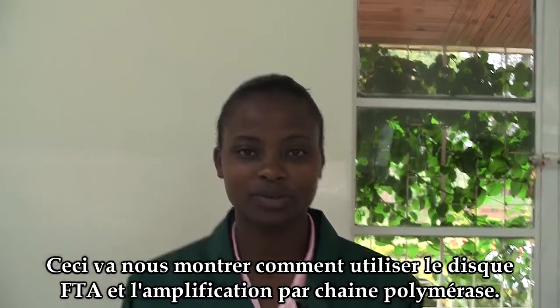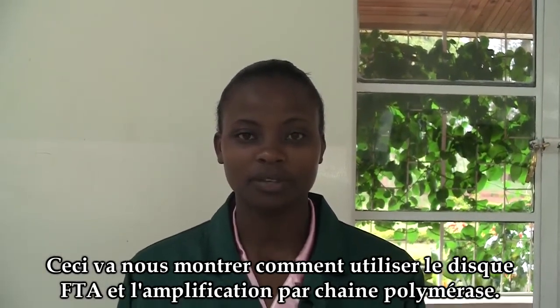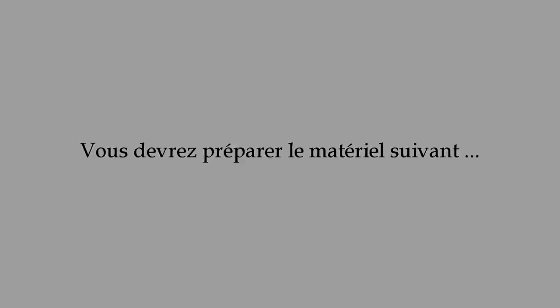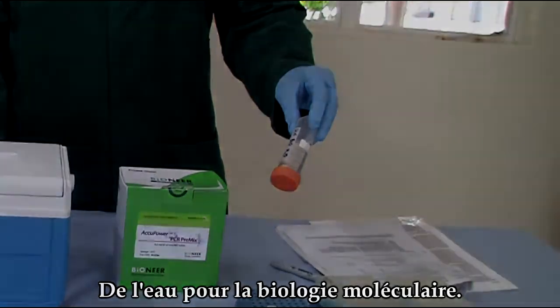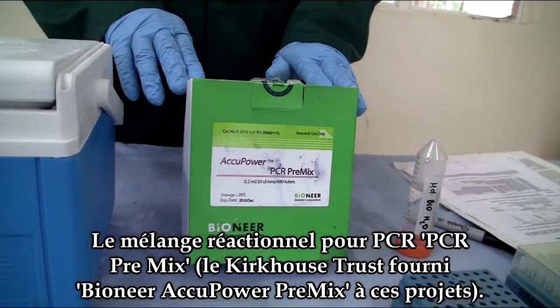This is the demonstration of using the FTA disc in the PCR amplification reaction. The materials required are: the air-dried FTA disc, molecular biology water, primers stored in ice, and the Bioneer premix.